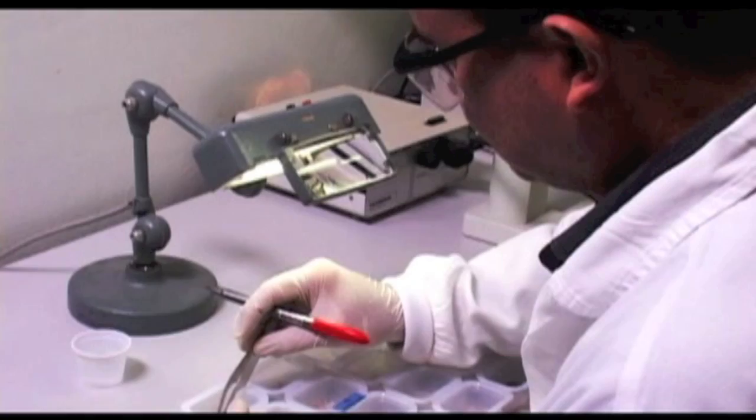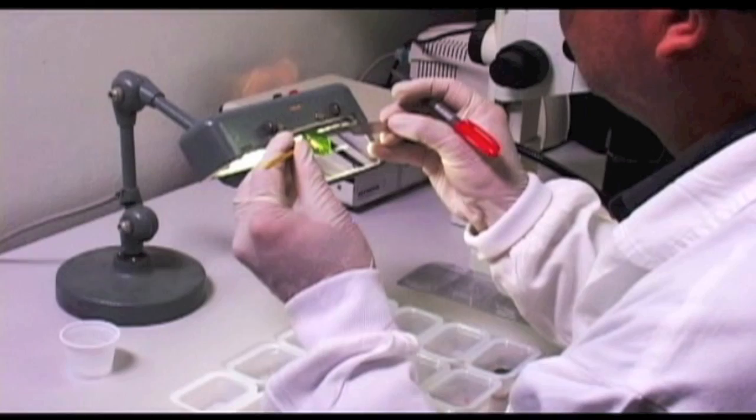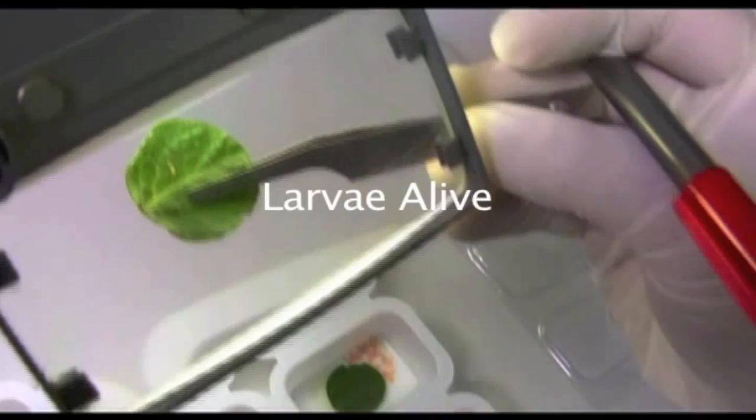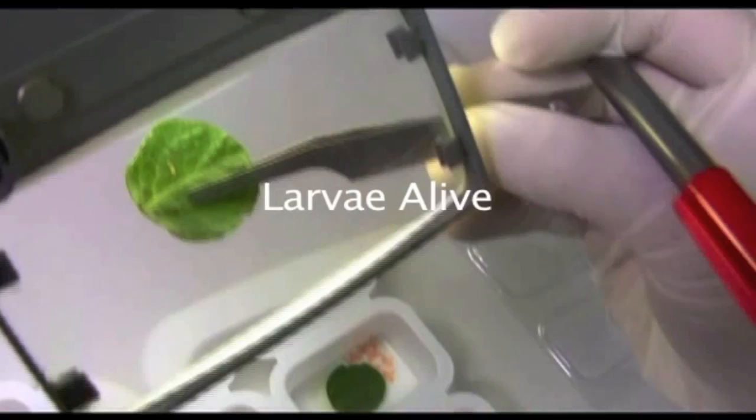Often it is necessary to open a leaf mine to find the larvae and inspect its condition. A stereo microscope could be used for this procedure, as it facilitates visualizing the condition of live versus moribund larvae, and also because dead larvae will often desiccate to a much smaller size than the initial 4 to 6 millimeters.